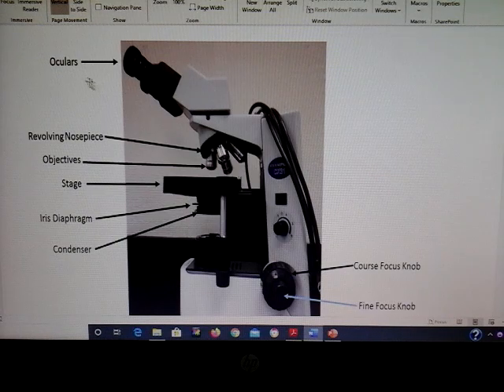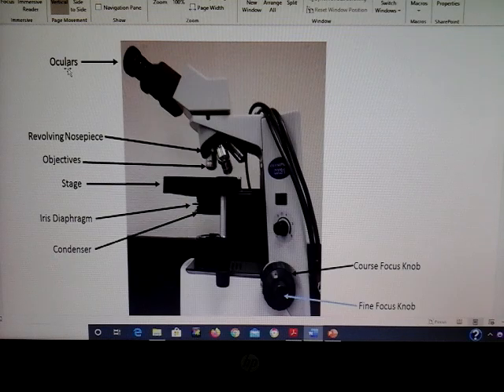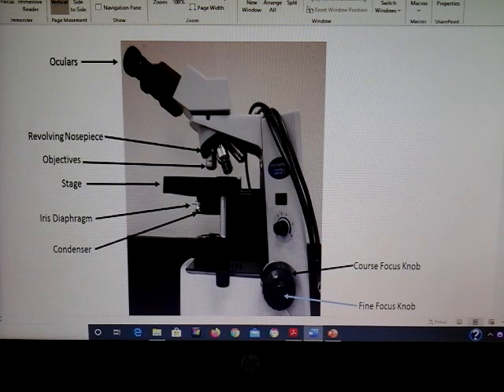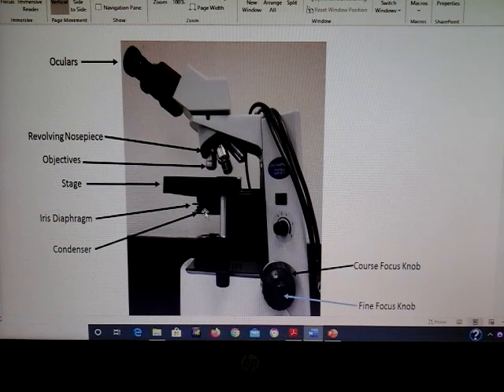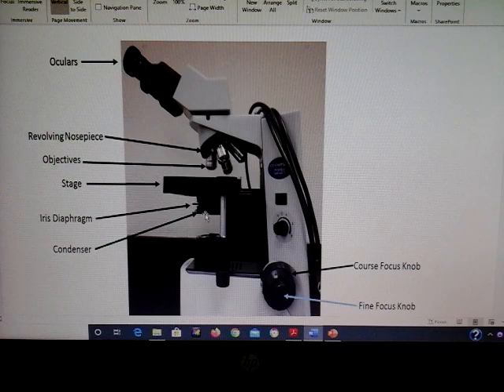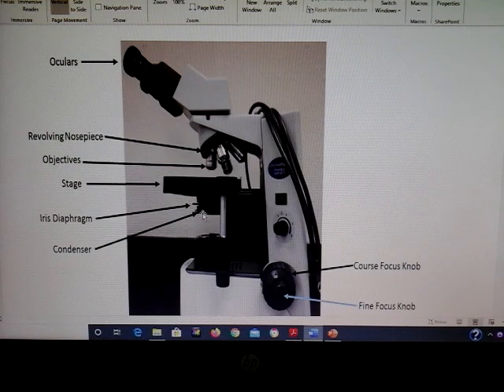Your oculars have a power of 10x — please know that. The iris diaphragm, this little knob, adjusts the amount of light that goes into your specimen. So the iris diaphragm adjusts the light entering the specimen.